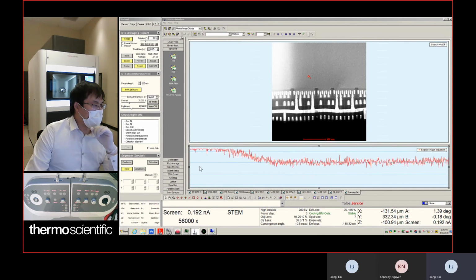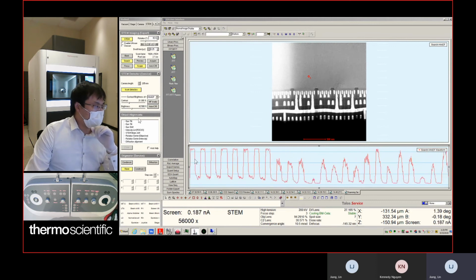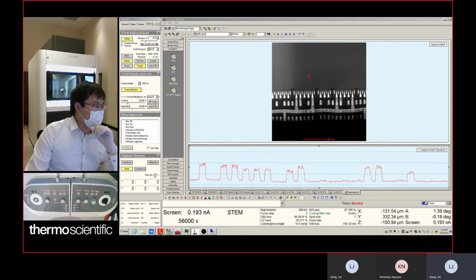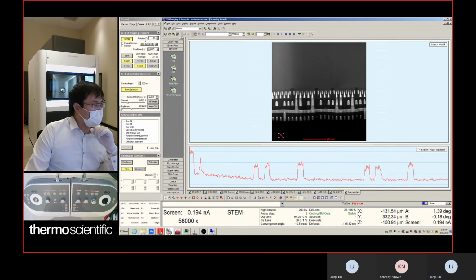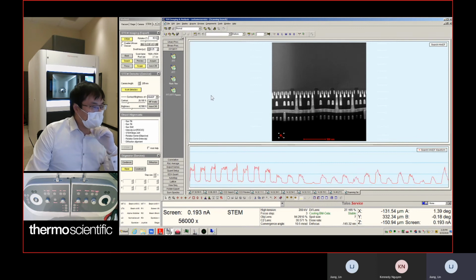to make sure that this red line is in between these two blue lines. But now it's over. It's like this. It's creeping. Yeah, this is good because your sample height is different. That's the reason we have different contrasts. Contrast variation is good. It's huge. Okay. Once we're done with that, we're ready to take the image.